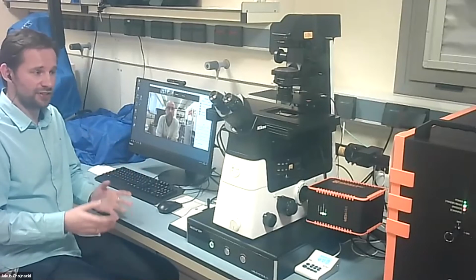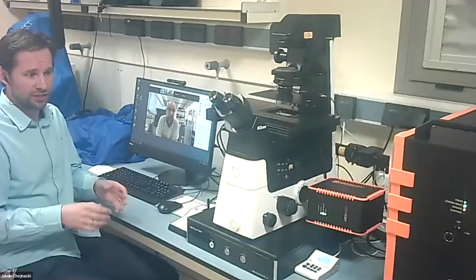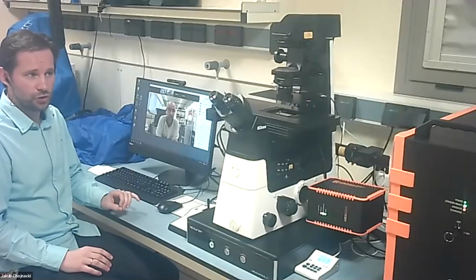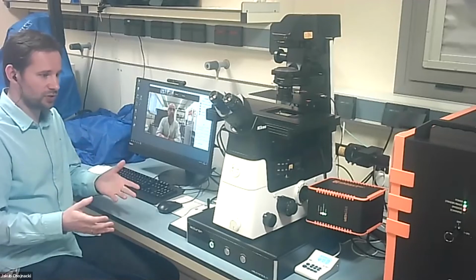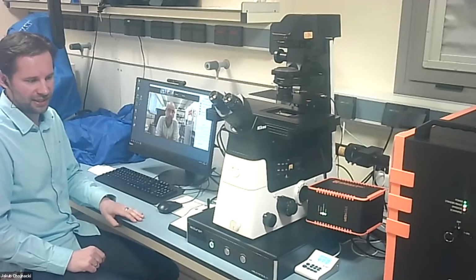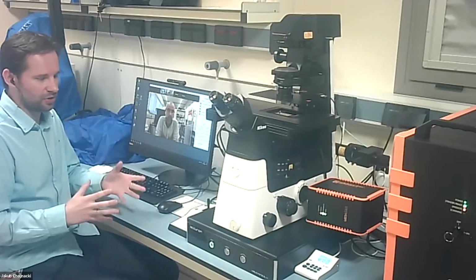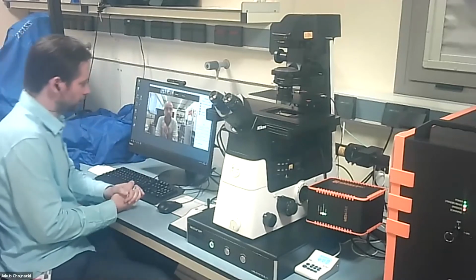We can study things in their physiological conditions. So I believe there is a huge field that is already opening up for a lot of studies, and they will bring a lot of new results that were not available before when you combine advanced resolution and live-cell imaging. So I think this field is going to grow quite rapidly thanks to all these advances. Because as scientists, we want to study things as they are, not as some sort of chemically treated models. We want to study things in physiological conditions. Great.